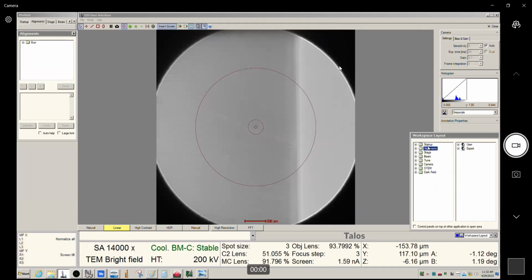I had a different question. A different question. Okay, go right ahead. Is there a way to change the alpha beta tilts manually by entering numbers instead of pressing that control panel? Okay, that's a great question.